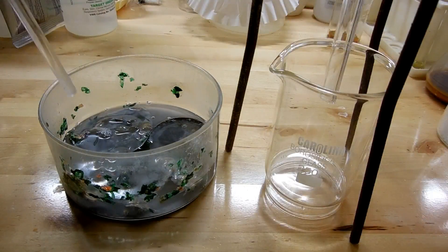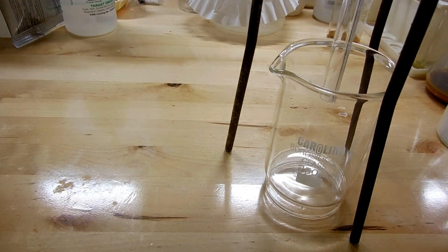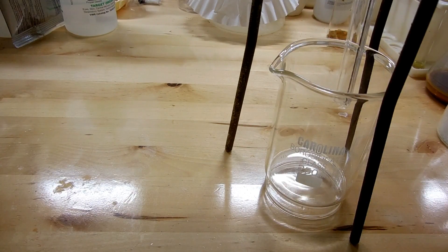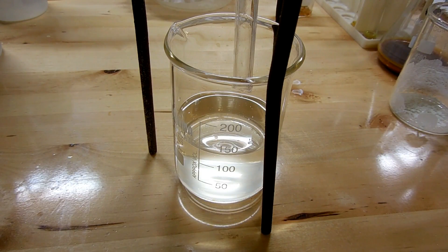I've left everything to react for about three hours, and you can see that the can is completely destroyed now. There's a lot of gray material floating around in there, as well as bits and pieces of the label and plastic — all of that needs to be filtered off. After filtering, interestingly, the volume has decreased significantly — down to about 125 milliliters from a little over 200. I think that's because the reaction to form potassium aluminate requires water, so it uses up some of the water of the solution.